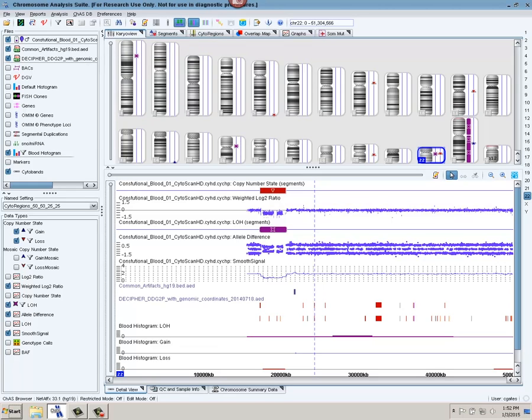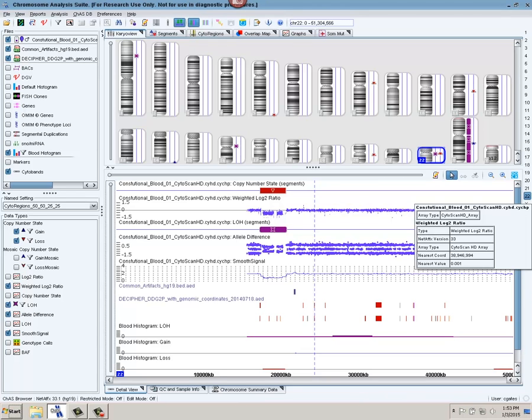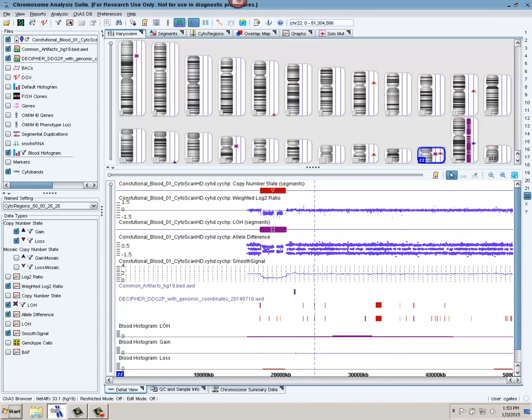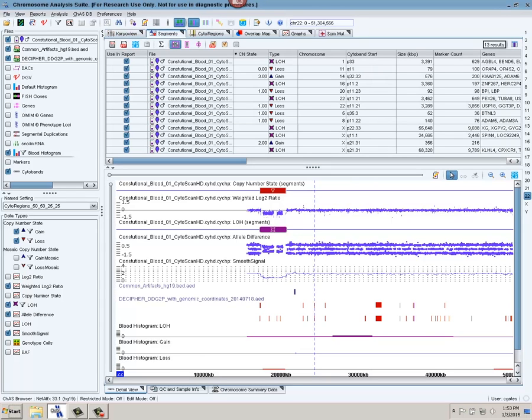So here we're looking at one sample in our browser. We have various external reference annotations that we can select. We have the karyo view that we're looking at, a whole genome view. Down here is the detail view, and right now we're clicked on chromosome 22. So this is the view of chromosome 22 and the raw data, as well as the various data tracks that we can turn on or off.